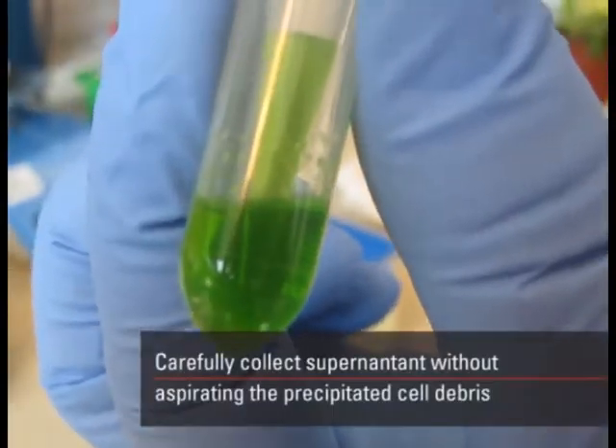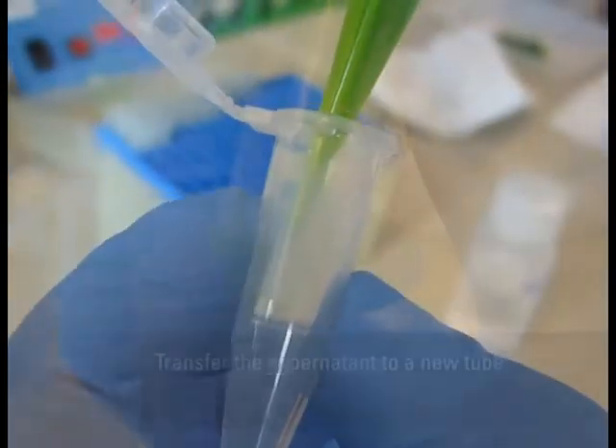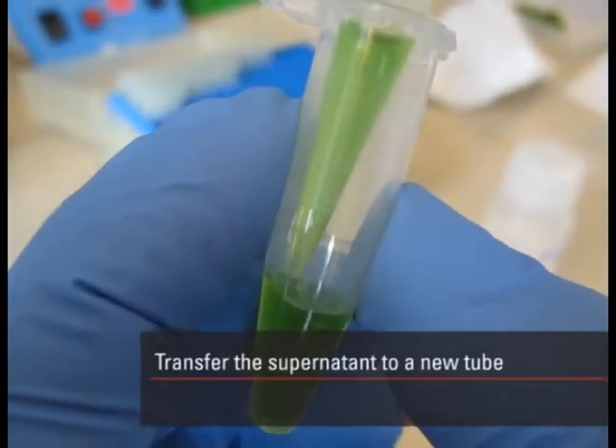Carefully collect the supernatant without aspirating the precipitated cell debris. Transfer the supernatant to a new tube.